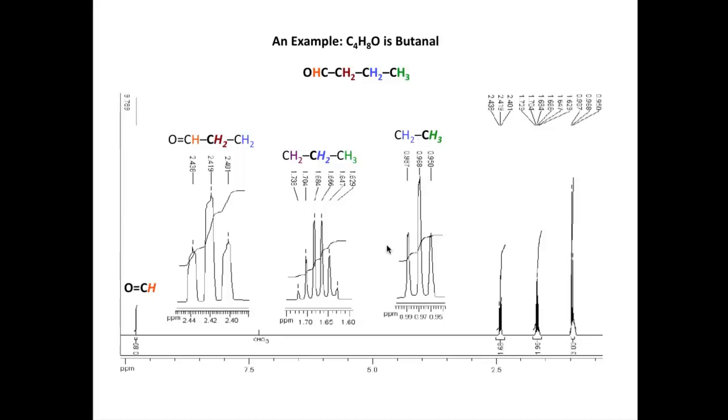Hydrogens in blue, associated with the signal around 1.67. In brown, associated with the signal around 2.4. And finally, the aldehyde signal way up near 10 ppm.